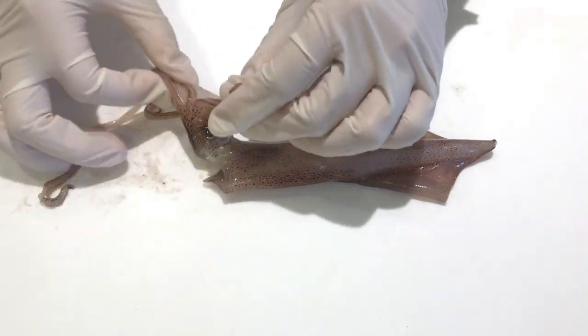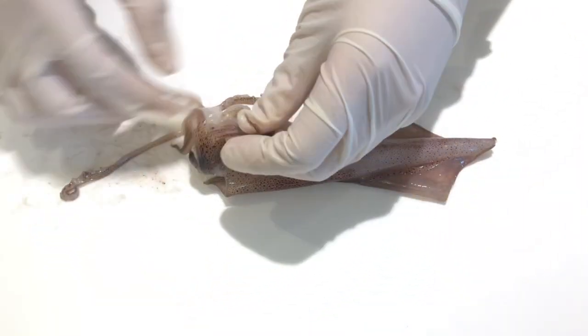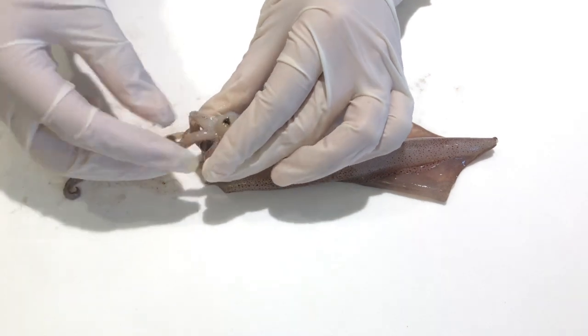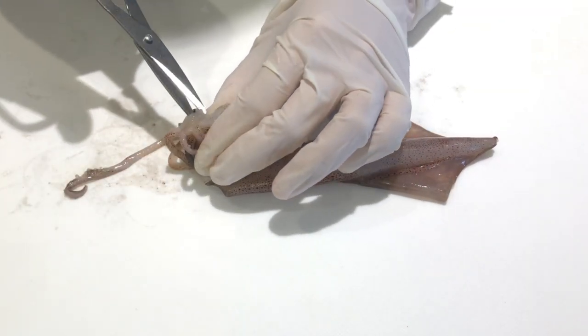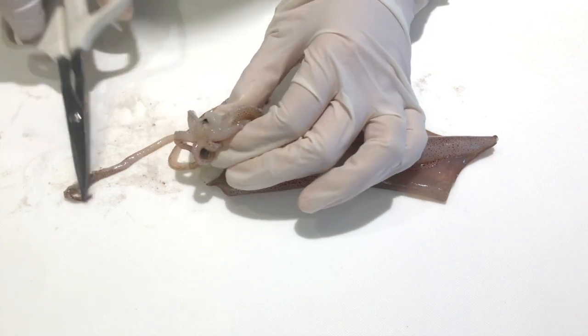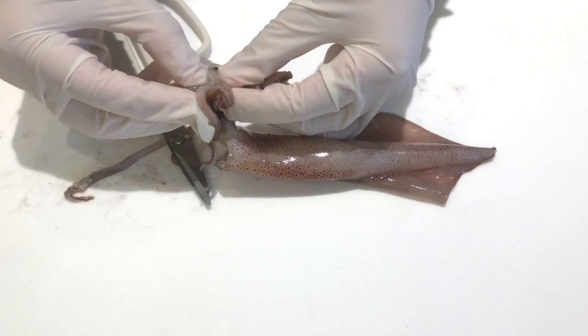First I dissected the beak. That's the little black structure right there, and there are actually two parts of the beak. What I did was I squeezed the thing until the beak came out, and I also made two white cuts so that it would be easier to remove the beak.